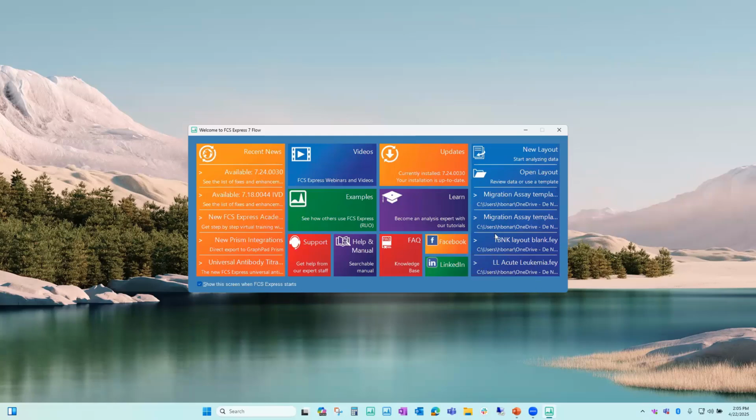These four options down here are our recently used templates. Templates that you've been in recently or have been using will show up here. This can be super helpful if you're using the same layout over and over again. It'll be listed here, and it just makes it easier to get to, so you don't have to navigate towards it. But we're going to start with a whole brand new layout, so I'm going to click that.